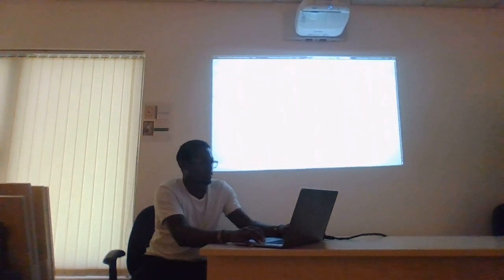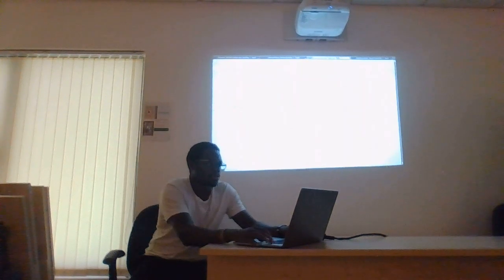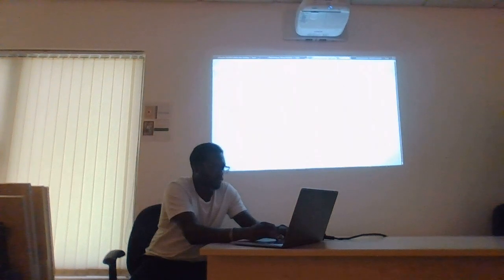The beauty of it, though, I noticed that it takes the log file also, it prints it out to the log file also. So you can easily format this because you've put the quotes, you can easily format this according to your simple pipeline, and then add some fancy stuff.